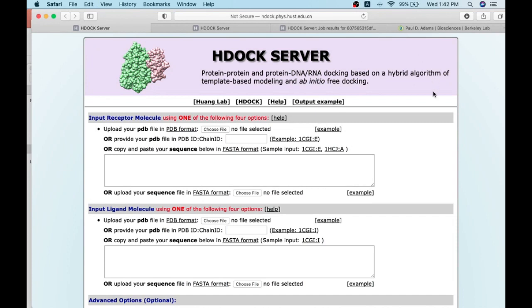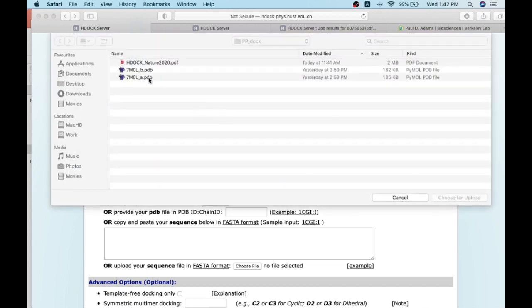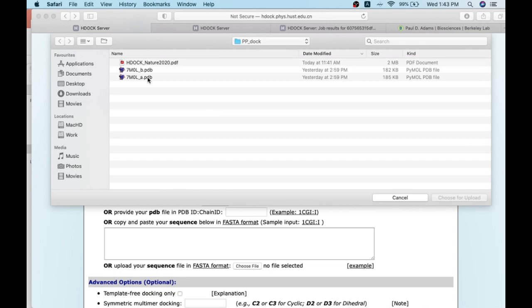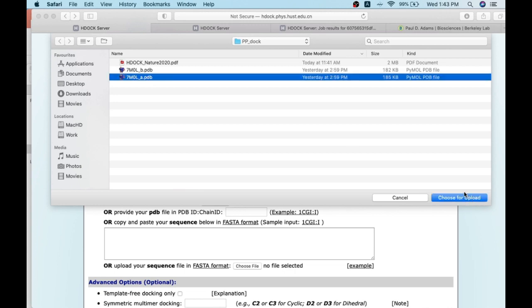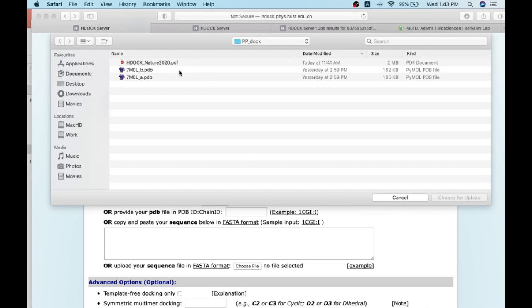This is the HDock web server page where you can see spaces to provide inputs either in structural coordinates format or as sequential information. Here I am giving the inputs by selecting the coordinates locally saved on my disk, or you can specify the PDB ID. I am giving the inputs as two protein chains of a mitogen-activated protein kinase — chain A is the first molecule and chain B is the second molecule.